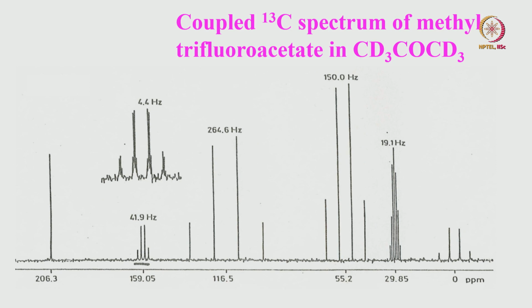Of course, the molecule is this one, methyl trifluoroacetate, and of course we are looking at the carbon 13 spectrum fully coupled, it is not decoupled. So that means you have fluorine carbon coupling and also proton carbon coupling both simultaneously present. That is why I took this example, so that we should know how to interpret such spectra.